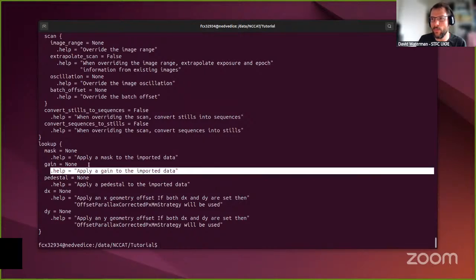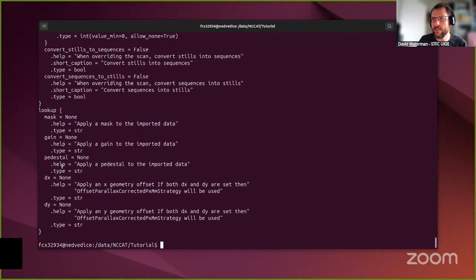It tells you what it means, and with a couple of V's, it tells you not only what it means but also what its type is expected to be. So with this stuff, you're hopefully able to figure out how the program works quite easily.